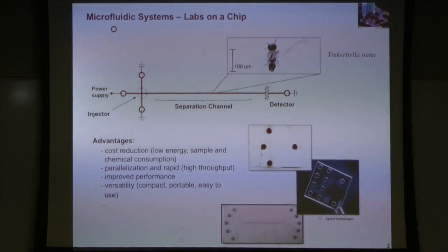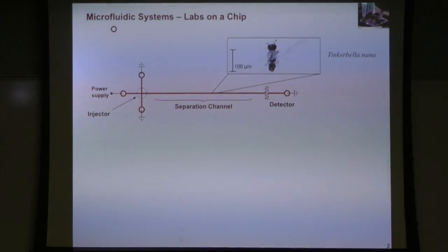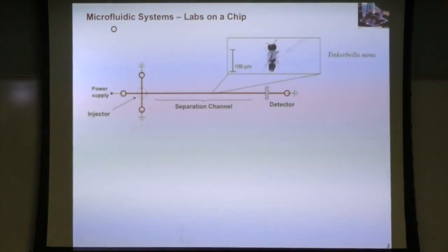You can carry them around, and they're easy to use, but maybe my graduate students might have another opinion about that. These are two examples of devices that we filled with dye, so you can see the channels and the reservoirs. And here, this is actually from a commercial device from the Agilent system. Since this has been around for a while, there are a few microfluidic systems that are now commercialized and sold. Over the past decades, there has been a large interest in going from benchtop systems, such as typically capillary electrophoresis, to miniaturizing into the microchip format. And this is an example, the Agilent Bioanalyzer.